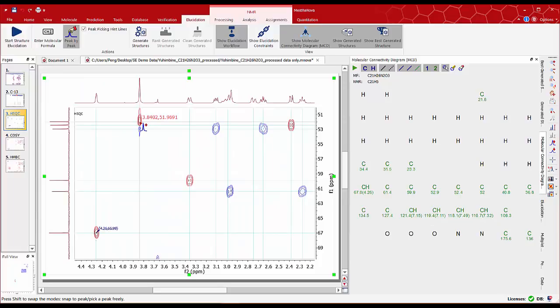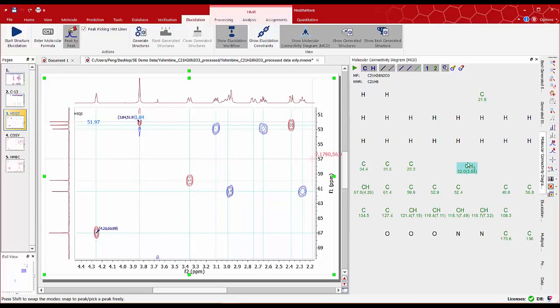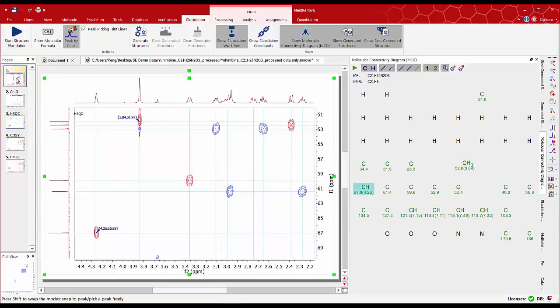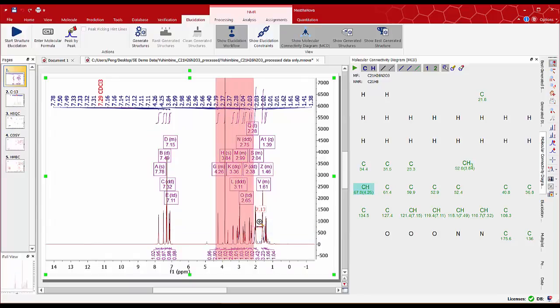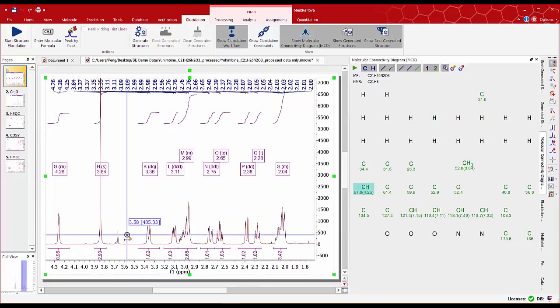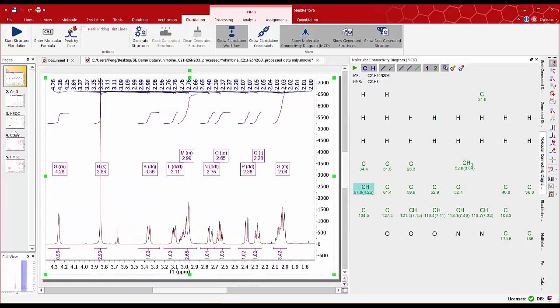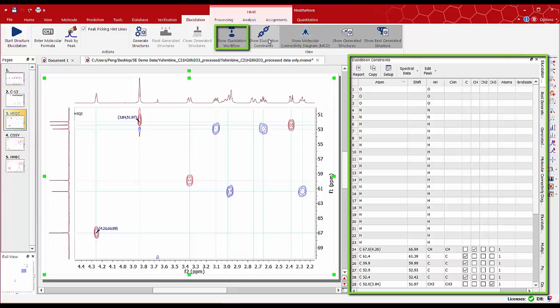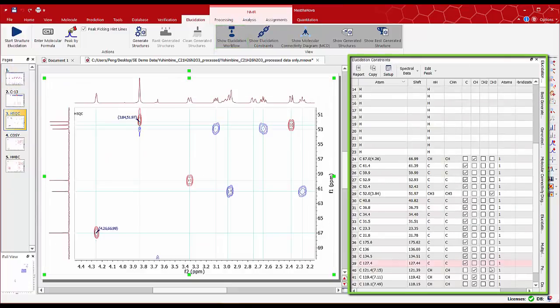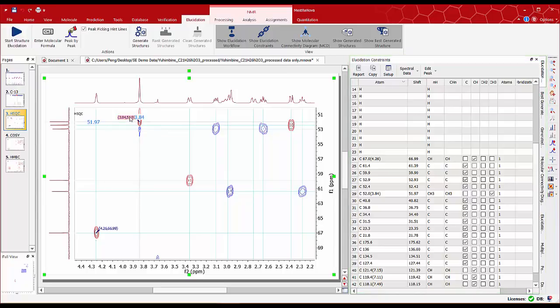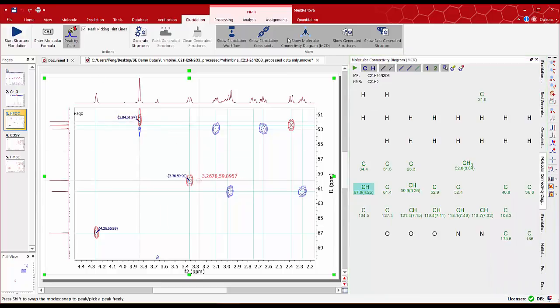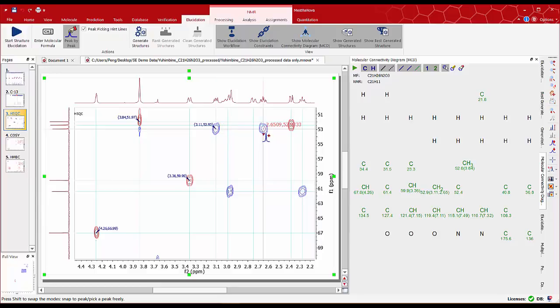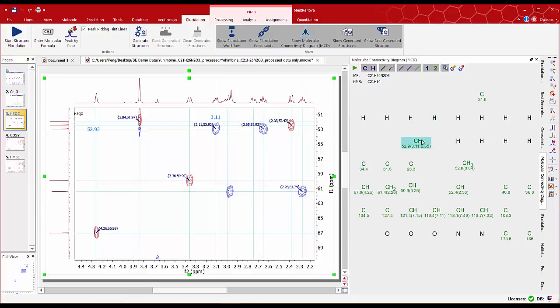The peak at about 52 ppm has been assigned as a CH3 group in the MCD panel. We can verify this by checking the integral in the 1D proton spectrum and we can see that the methyl group at about 3.8 ppm. We can review them all and if we find that any of these peaks is not well assigned we can always edit it using the constraints table. So let's carry out peak by peak picking on the HSQC to get them assigned properly.